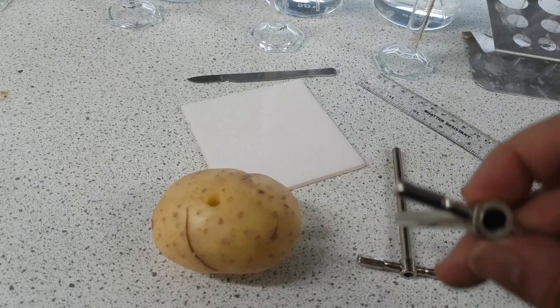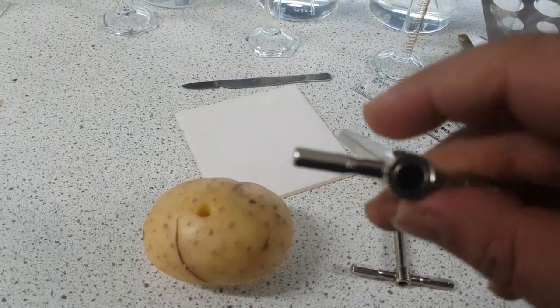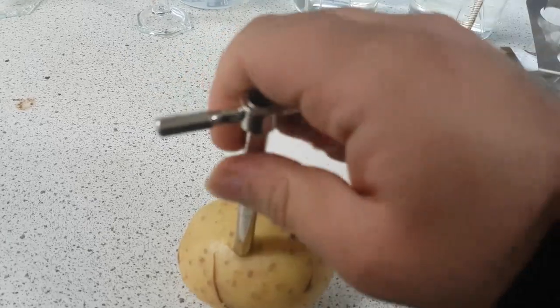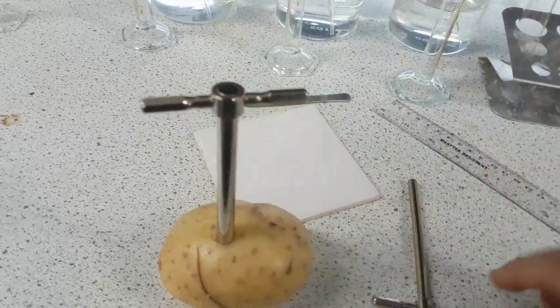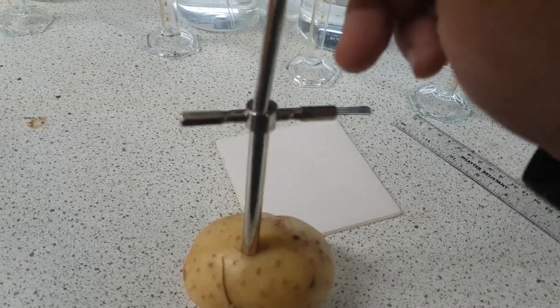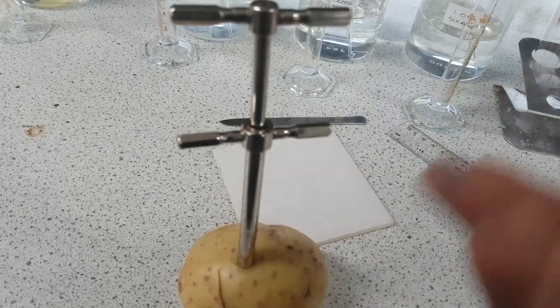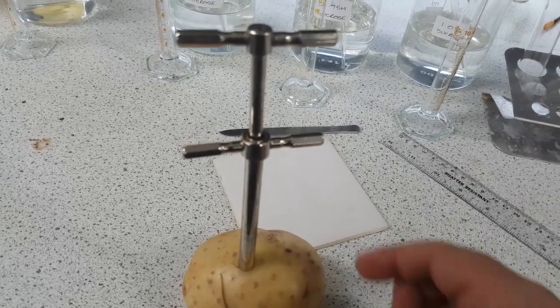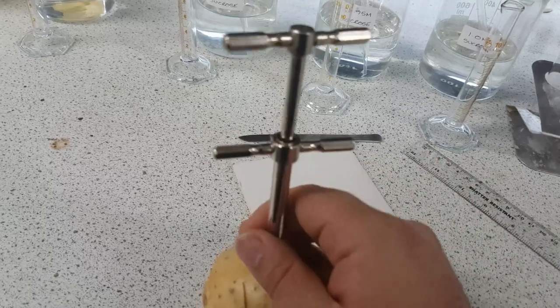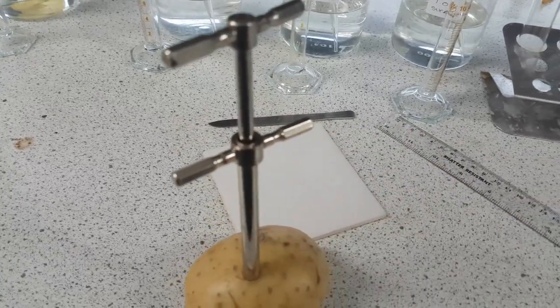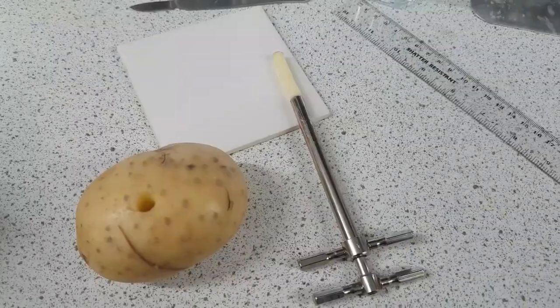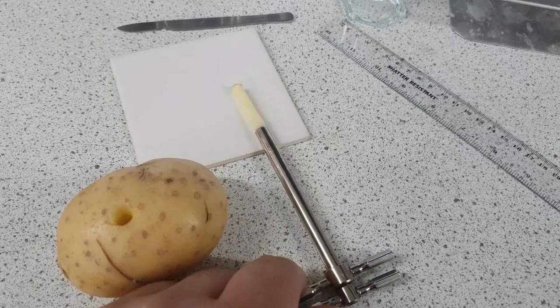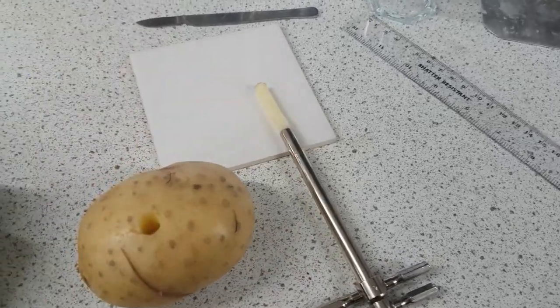And then what you're going to do is you're going to stick the other cork borer into this one and push it out. Just to demonstrate, I'm going to put that back in there so I can show you what I mean. I'm going to push this into here. Now I'm going to take them both out because otherwise the potato probably won't come out. And then I'm going to slide the cylinder of potato out. I've put in the smaller cork borer and it's pushed the cylinder of potato out.